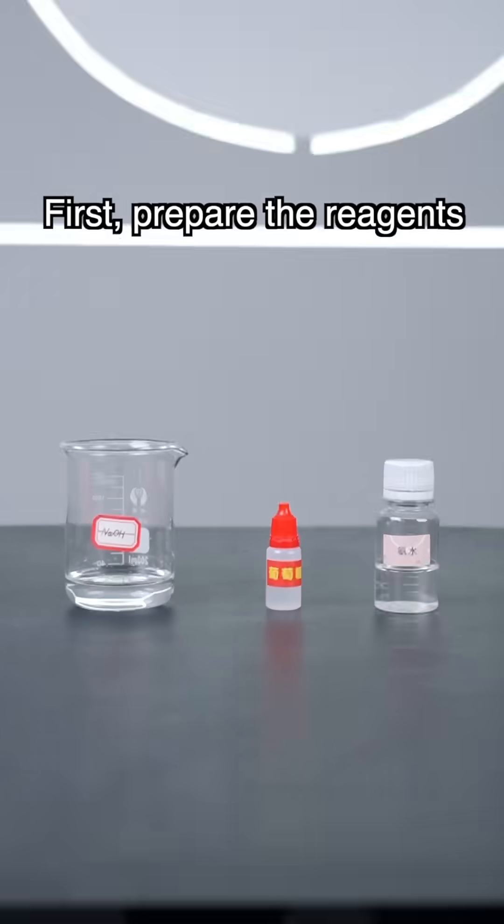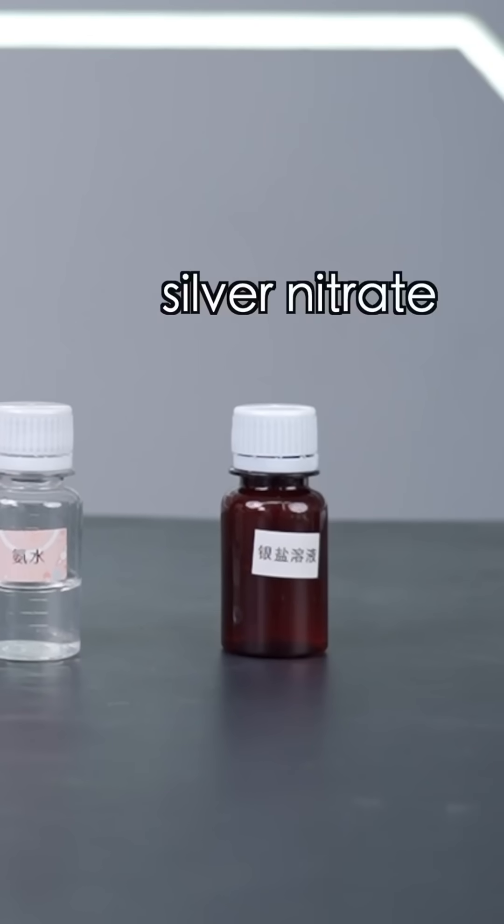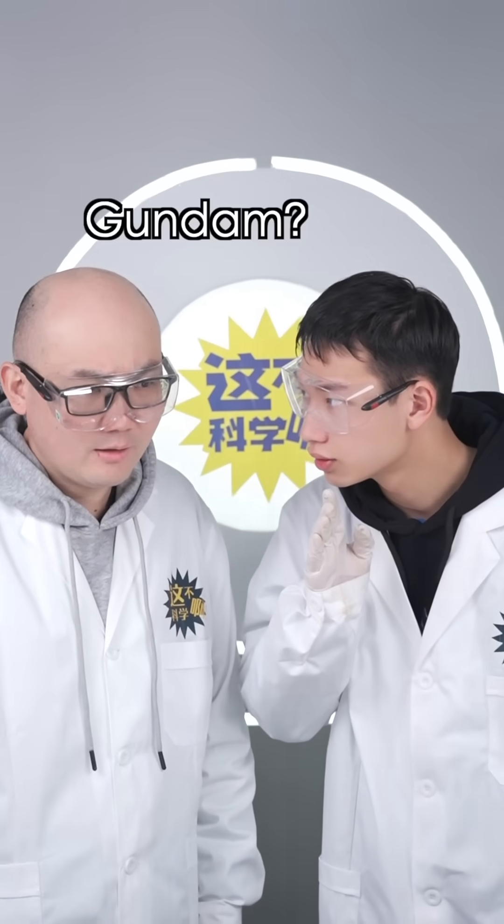First, prepare the reagents: sodium hydroxide, glucose, ammonia solution, and silver nitrate. Silver nitrate? Sounds expensive, doesn't it? Yes, as expensive as Gundam. Gundam? Where is Gundam?